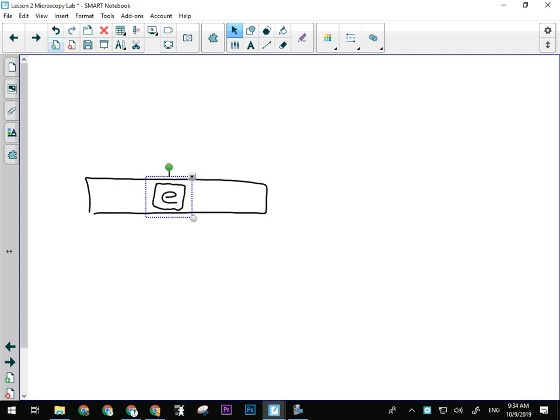somewhere near the middle. Okay, then you will have two other things. You will have a cover slip, which is a square piece of transparent plastic, and you'll have an eyedropper with some water in it. Once you put the letter E on the microscope slide, you want to make sure the letter E is right side up. Then you want to put the eyedropper on the letter E, like literally pushing it onto the slide, and dispense some water. If you drop the water onto the letter E, it'll flip over.